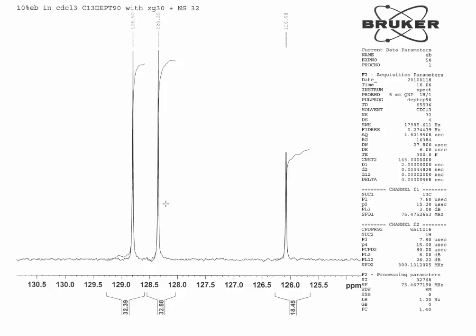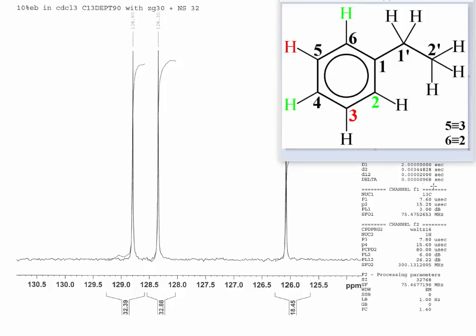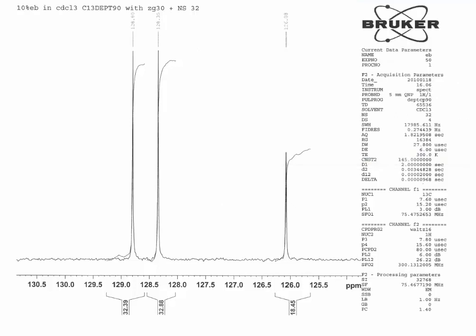Here's the zoomed in spectrum. We see three peaks. These would be due to the carbons at positions 2, 3, and 4. 2 and 6 are the same. 3 and 5 are the same. So they would be due to 2, 3, and 4. Which one is which? That's the question we're going to try to answer.